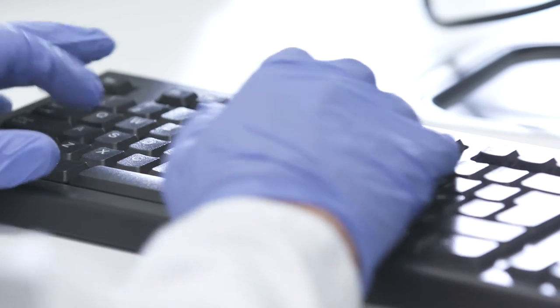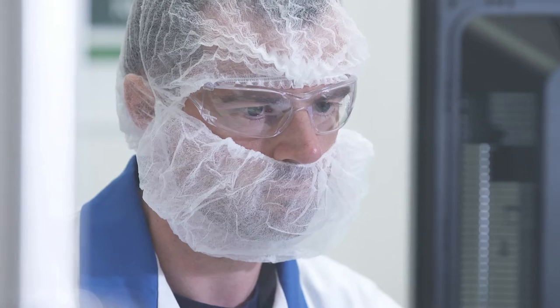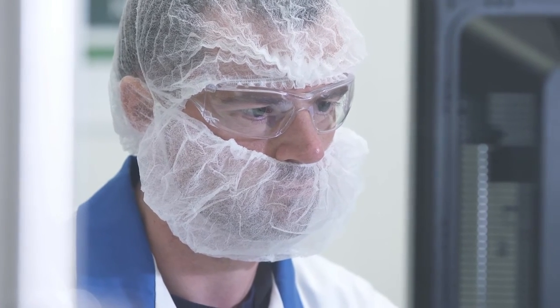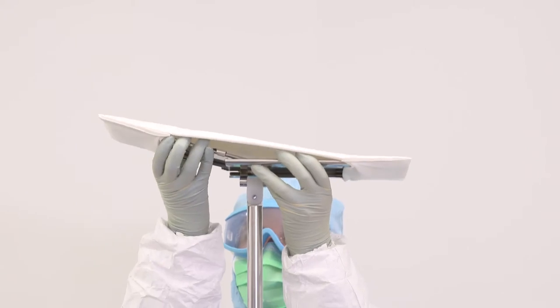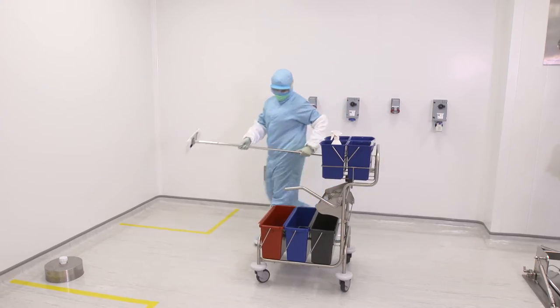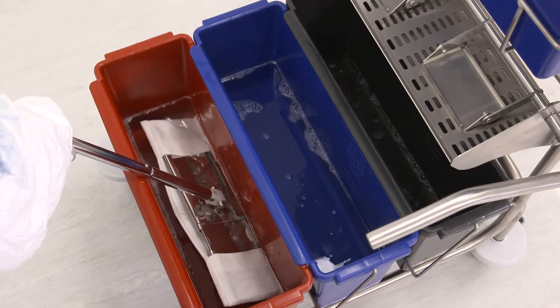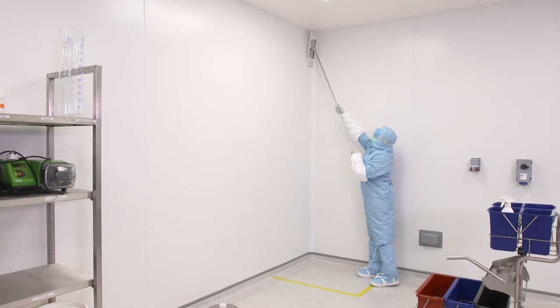With no extra personnel, the job of the clean room manager has become to do more with less. Cleaning and disinfection of clean room manufacturing environments impacts all aspects of productivity. It's critical to maintain clean rooms to strict industry standards.